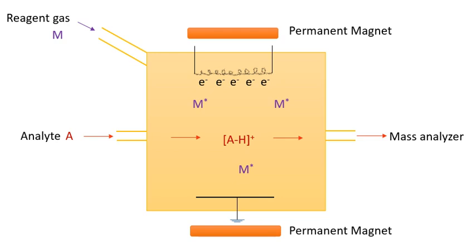mass. This technique requires the transfer of high-mass entities from the reagent gas to the analyte, and therefore, the Franck-Condon principle does not govern the process of ionization. CI is thus quite useful in cases where the energy of the bombarding electrons in EI is high, resulting exclusively in fragmentation of the analyte, causing the molecular ion peak to be less detectable or completely absent.